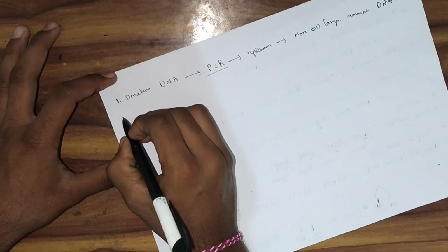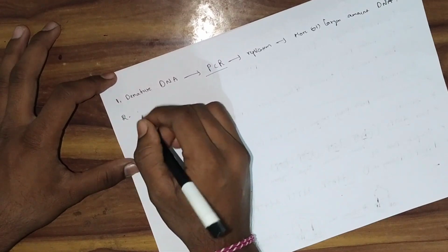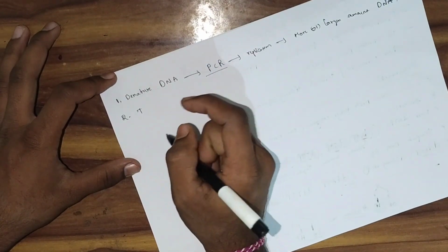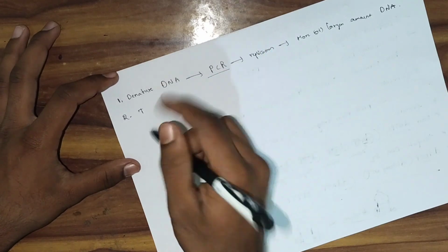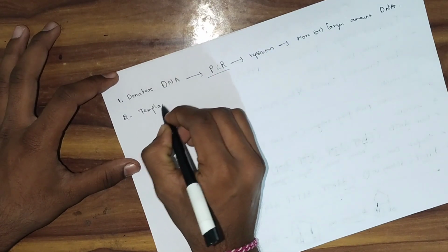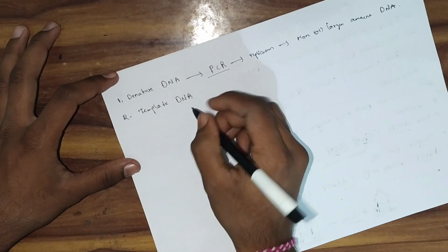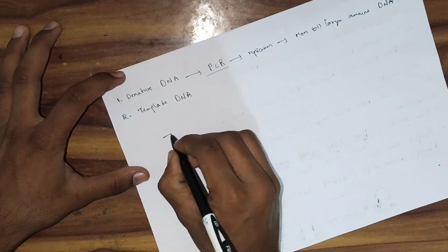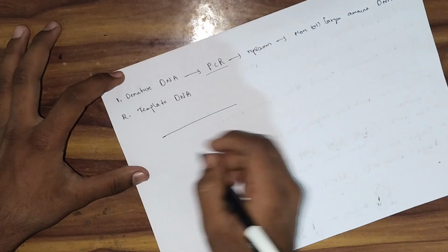After that, if we take a specific part of DNA, that DNA is called the template DNA.